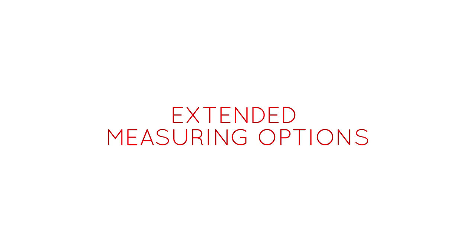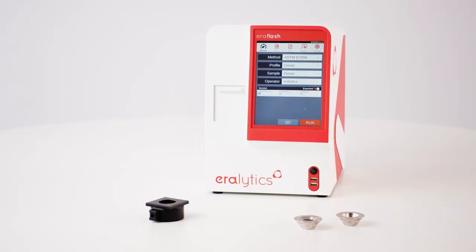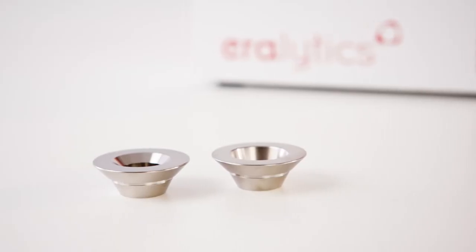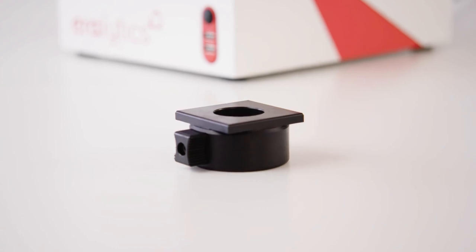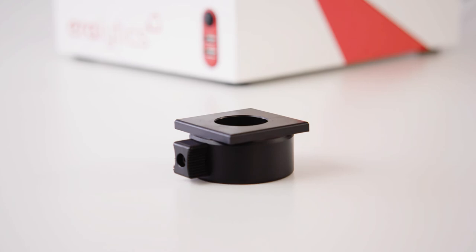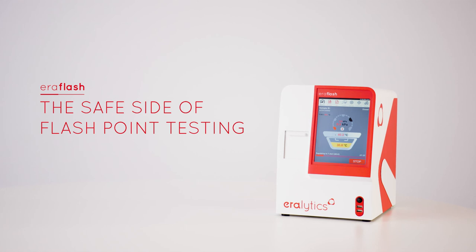Extended measuring options. AeroFlash can also be equipped with a high temperature model for measurements up to 420 degrees Celsius, stainless steel cups for corrosive samples, and a cooling cup in combination with an external chiller for low temperature flash point samples. AeroFlash — the safe side of flash point testing.